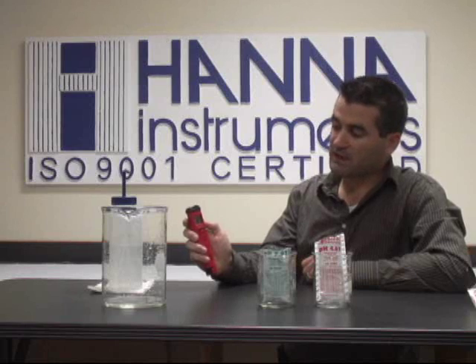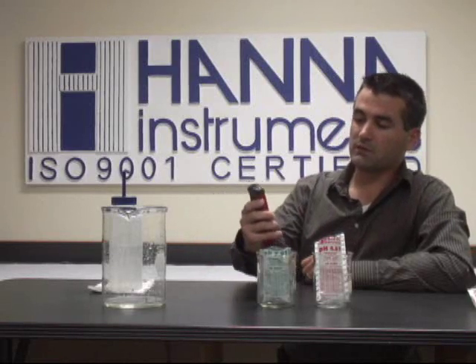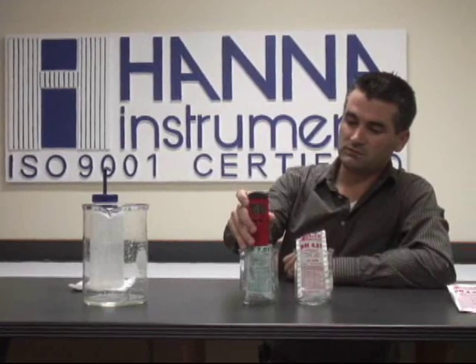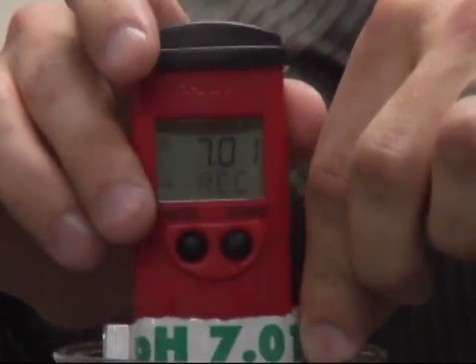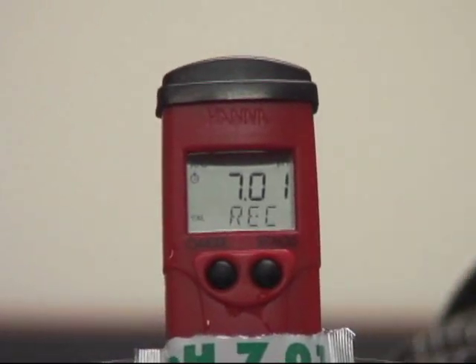As you can probably see, it's saying to use 7.01 buffer. So we're going to stick it in the 7.01 buffer and give it a few seconds.